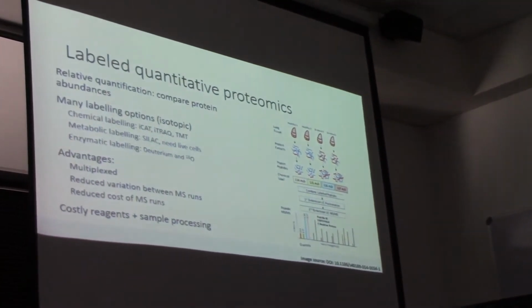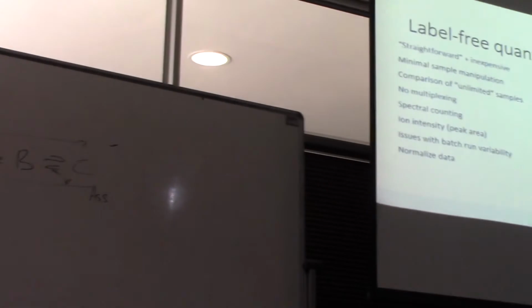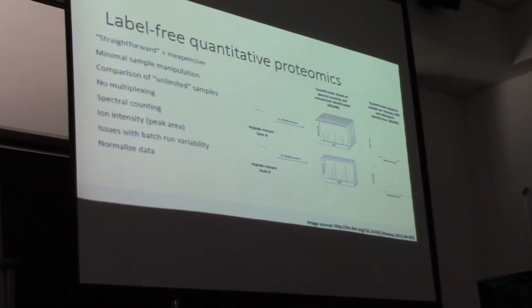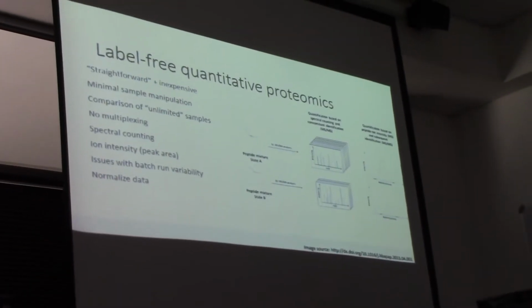So, moving on, label-free quantitative proteomics. It's more "straightforward", and I put this in inverted commas because I think if anyone's done label-free, they know that it's not that straightforward to interpret. You really do need to understand and know what you're doing.